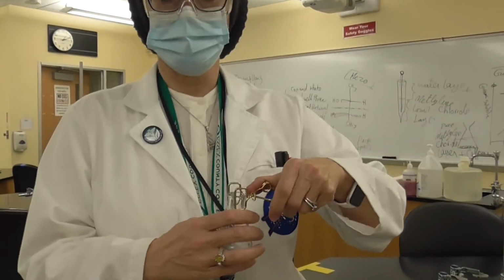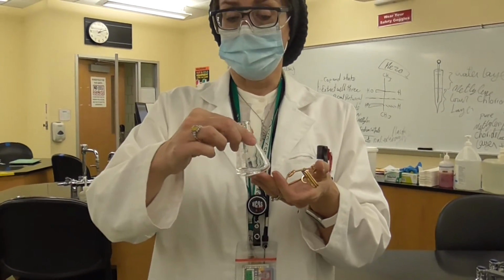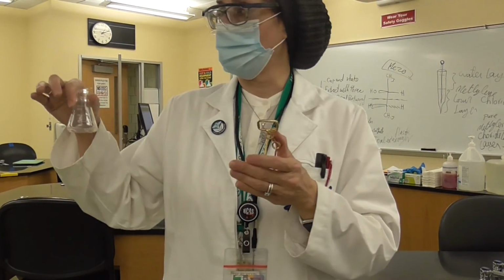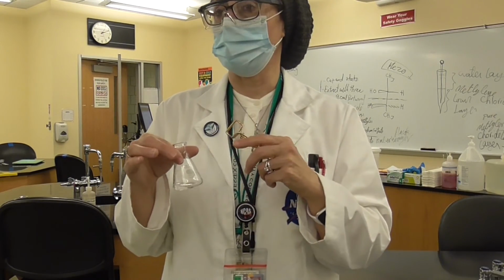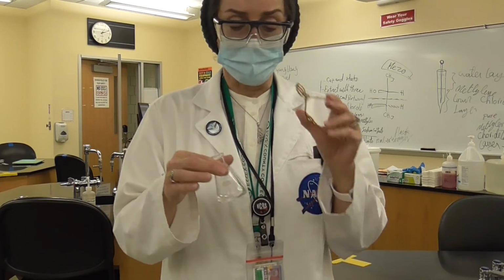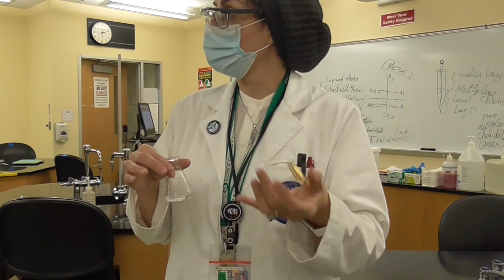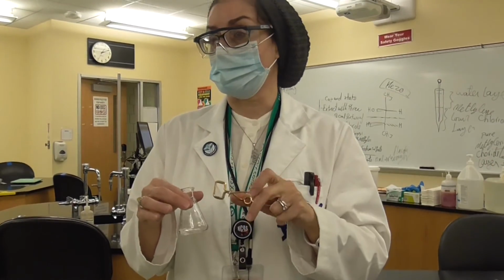So that's basically what we're going to do next. We are going to take that Erlenmeyer flask and put it in a water bath, trying to evaporate the organic layer of methylene chloride. And hopefully we will be able to collect the caffeine that we extracted through this process today.